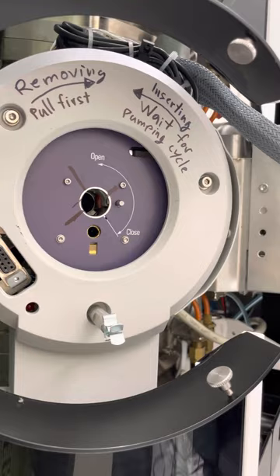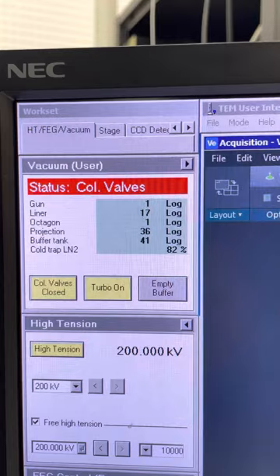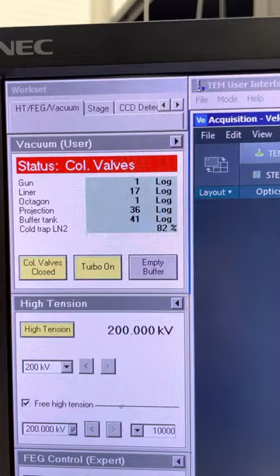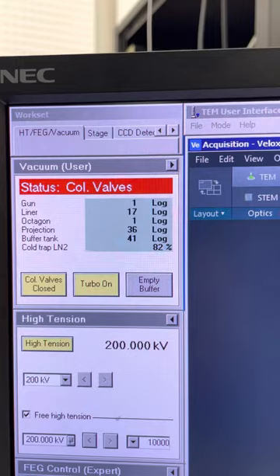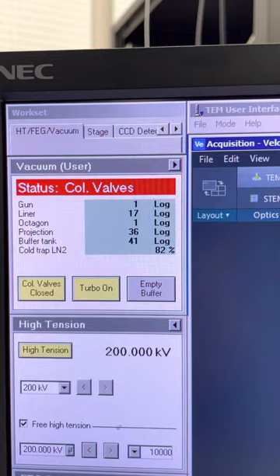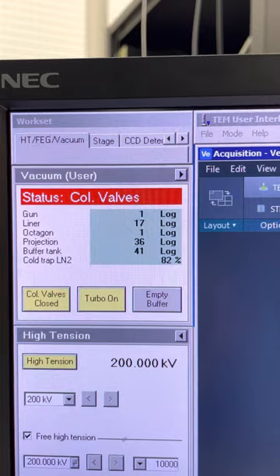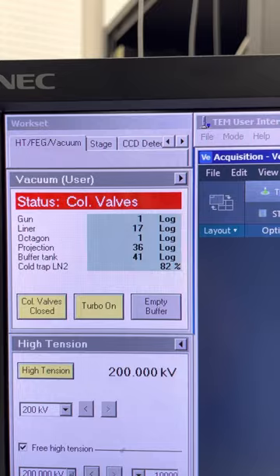Before you insert the holder, make sure the vacuum is okay. If you see the vacuum user window, make sure the octagon, which is the column vacuum, is good. In this log scale, in this particular microscope, octagon should be below 15. Without specimen, you'll see octagon one or two or three. With the specimen in, it goes up to 15, 16, maybe 20, but it should drop down real quick. Make sure the vacuum is okay. Everything is green, and octagon in particular is below 15.